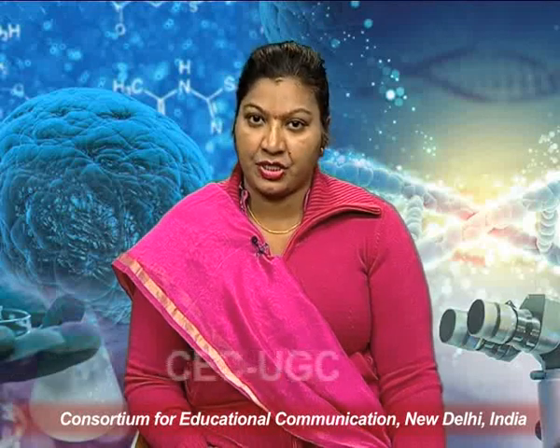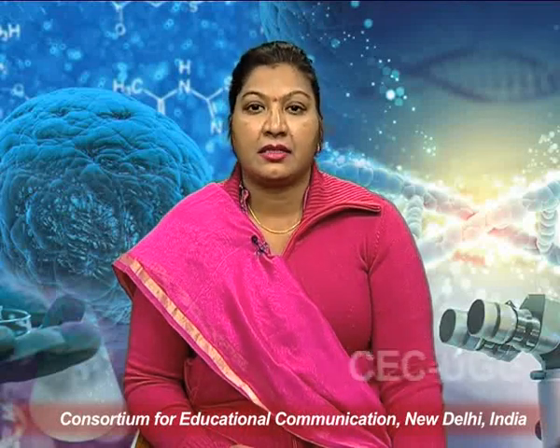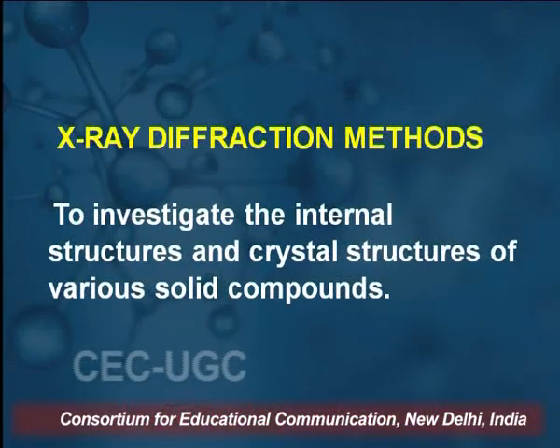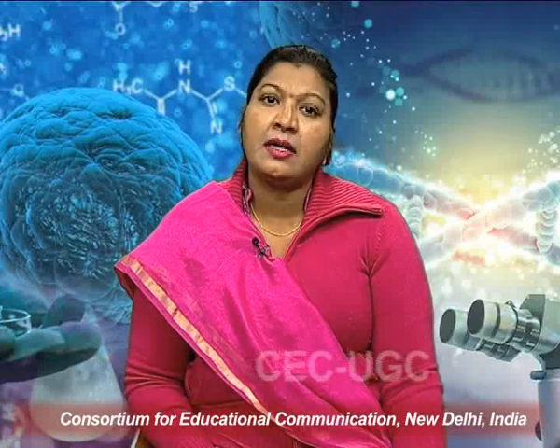We discuss today the XRD methods. What are the methods of X-ray diffraction to get the surface structure of the nanomaterials? The X-ray diffraction method is used to investigate the internal structure and the crystal structure of various solid components. Components may be a single crystal, or a mixture of crystals, meaning the crystal may be composed of 2 or 3 materials, and we discuss its internal structure, and the crystal structure can be determined by using this X-ray diffraction method.